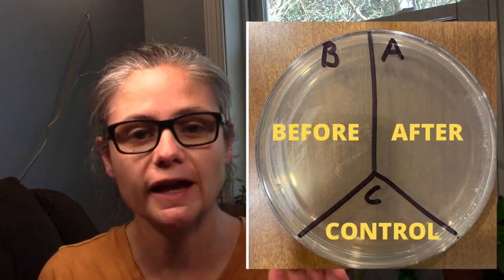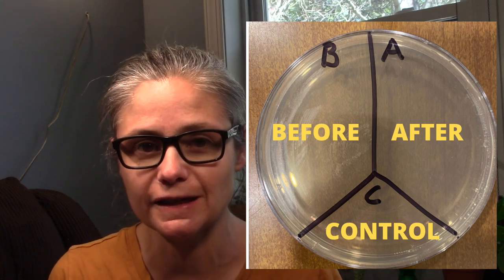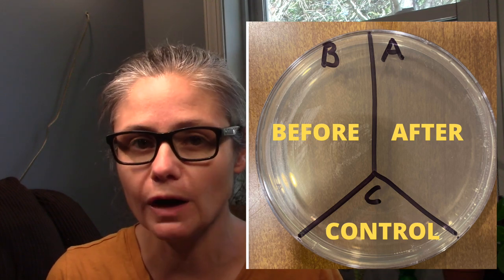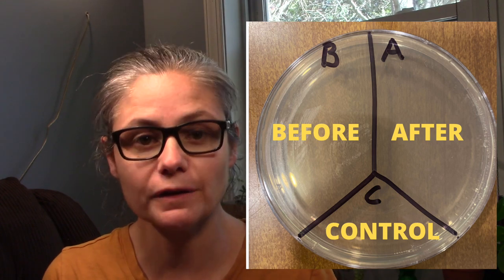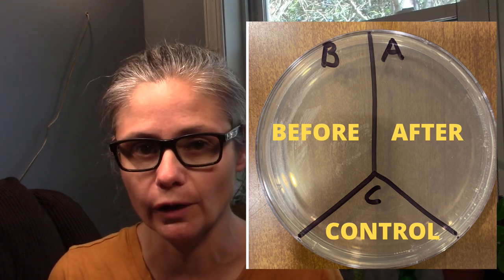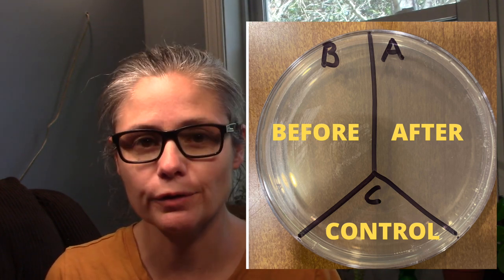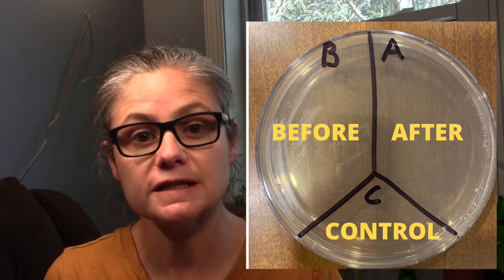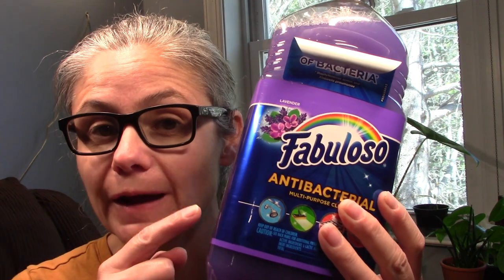In order to test Fabuloso's disinfecting power, I'm going to take a Petri dish and gather some sterile swabs. I'm going to label this Petri dish A, B, and C. I'm going to take a sterile swab and swab areas of my home that I would like to test Fabuloso on. Then I will place that sample on B for before. Then I'll clean with the Fabuloso, swab again, and put that sample in A for after. C is the control, I don't put anything there. So let's see how well Fabuloso disinfects my home.